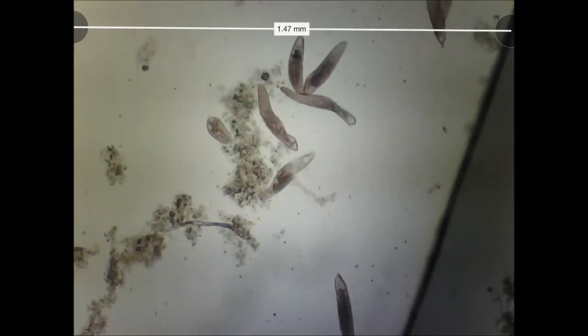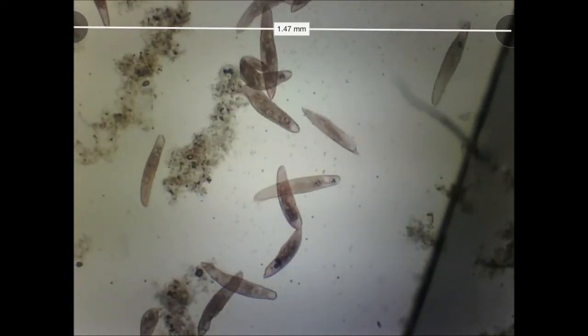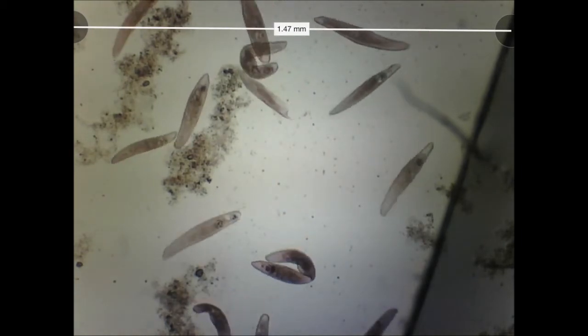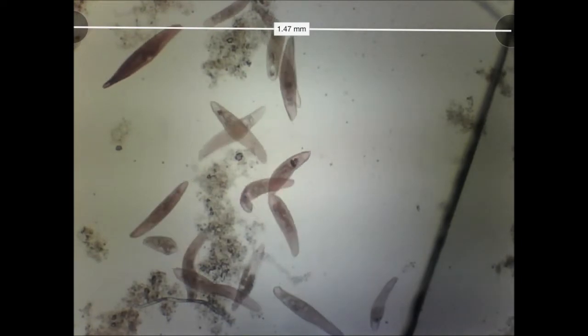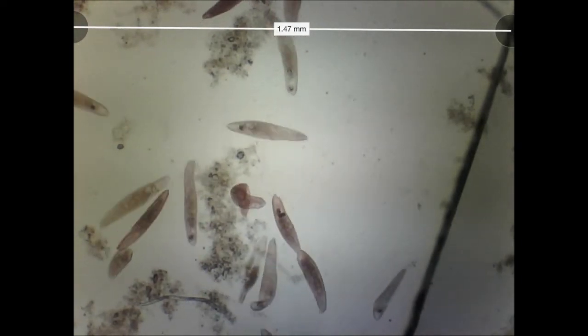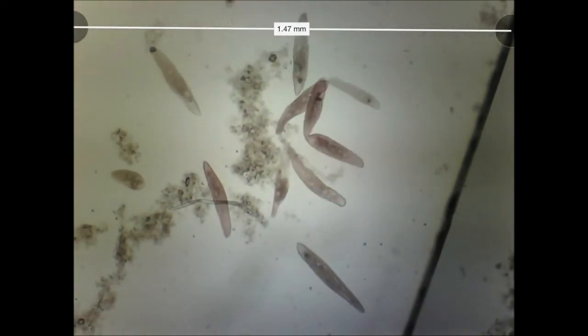Here we're zooming out now and happen to capture one blepharisma in the midst of dividing. You can see in the middle of the screen there, it's attached end-to-end, so this is in the process of what we call fission.